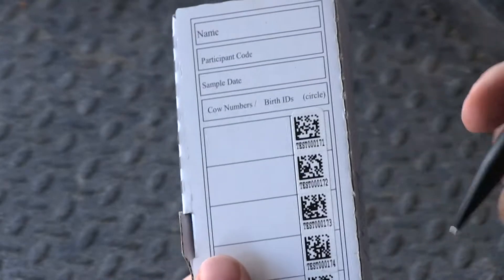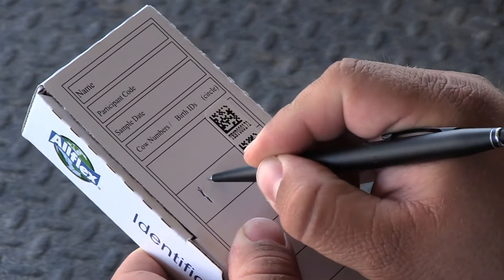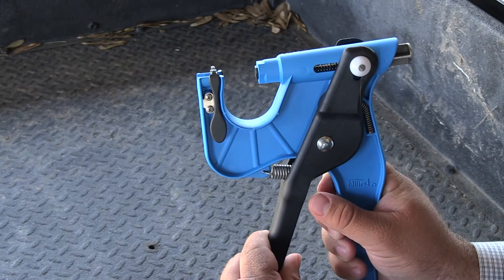It's in option number two. We'll hand write the visual tag number of the calf or the animal right in that box. Pull the handles backwards to release the cutter and apply a new TSU for the next animal as it comes into the chute.